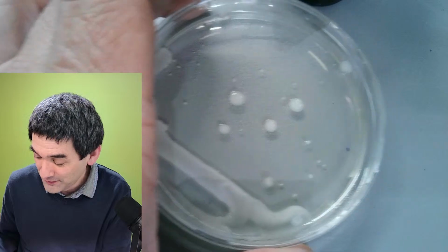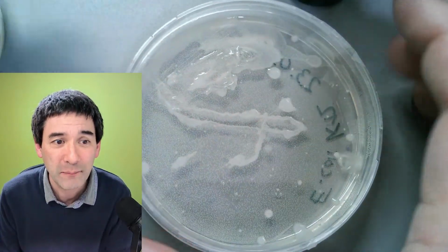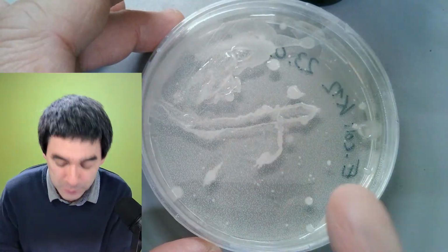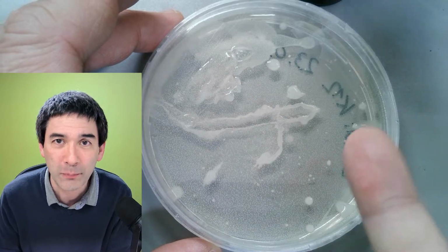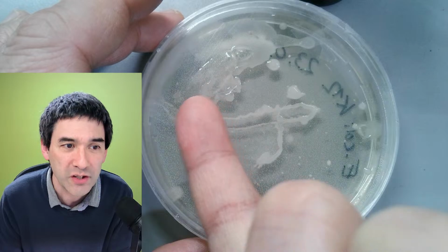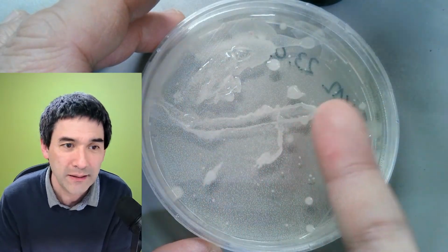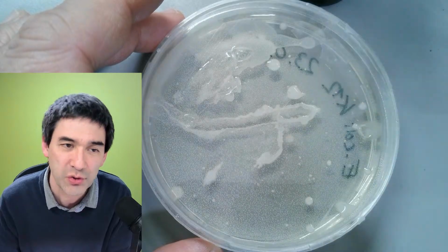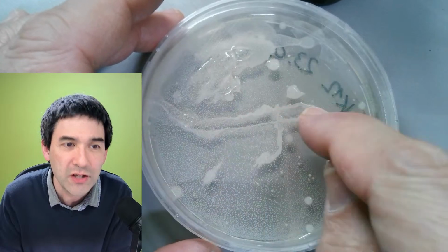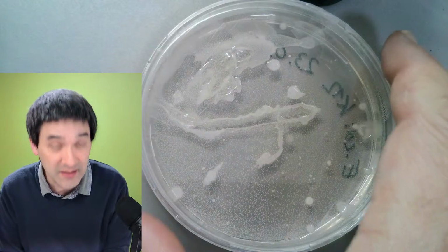And over here, this one here, another plate, I tried to grow some E. coli bacteria. I've got E. coli in capsules, but the problem is that because I did not boil the medium long enough, the agar medium did not get solid. So basically I had problems streaking out the cells here, yeah, because the agar was so soft. So it was a disaster. Okay, but at least these things that you see here are gram-negative E. coli bacteria, which I'll be using. So in that sense, it's still workable.